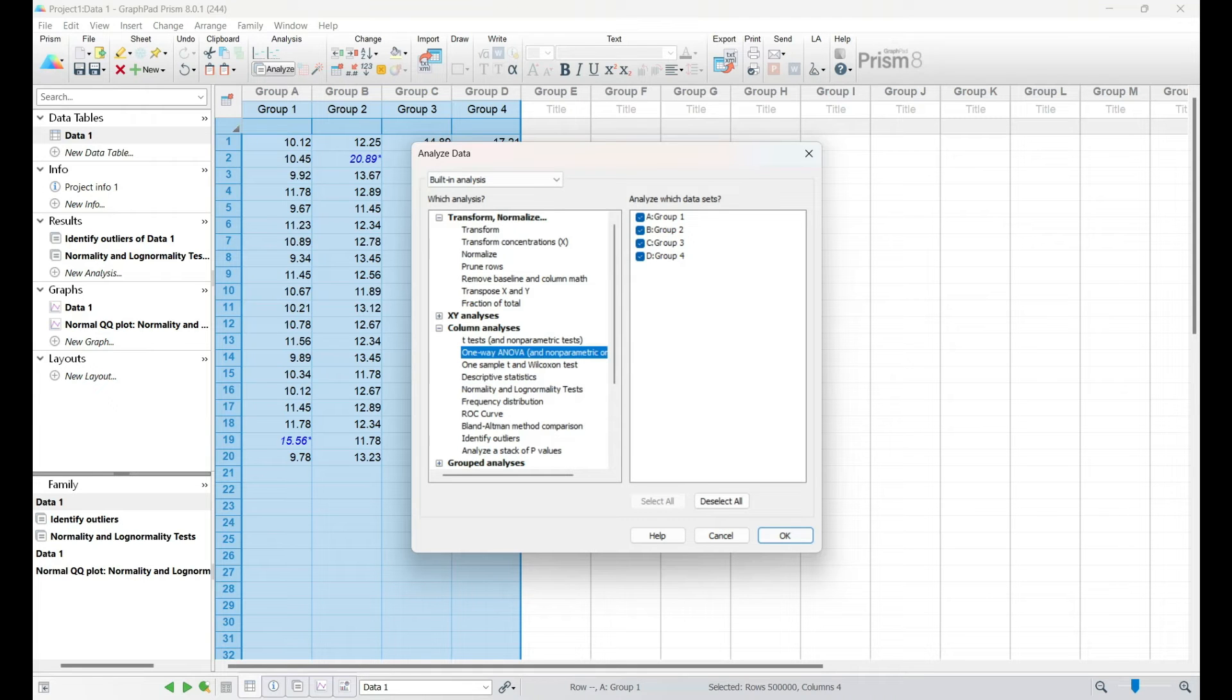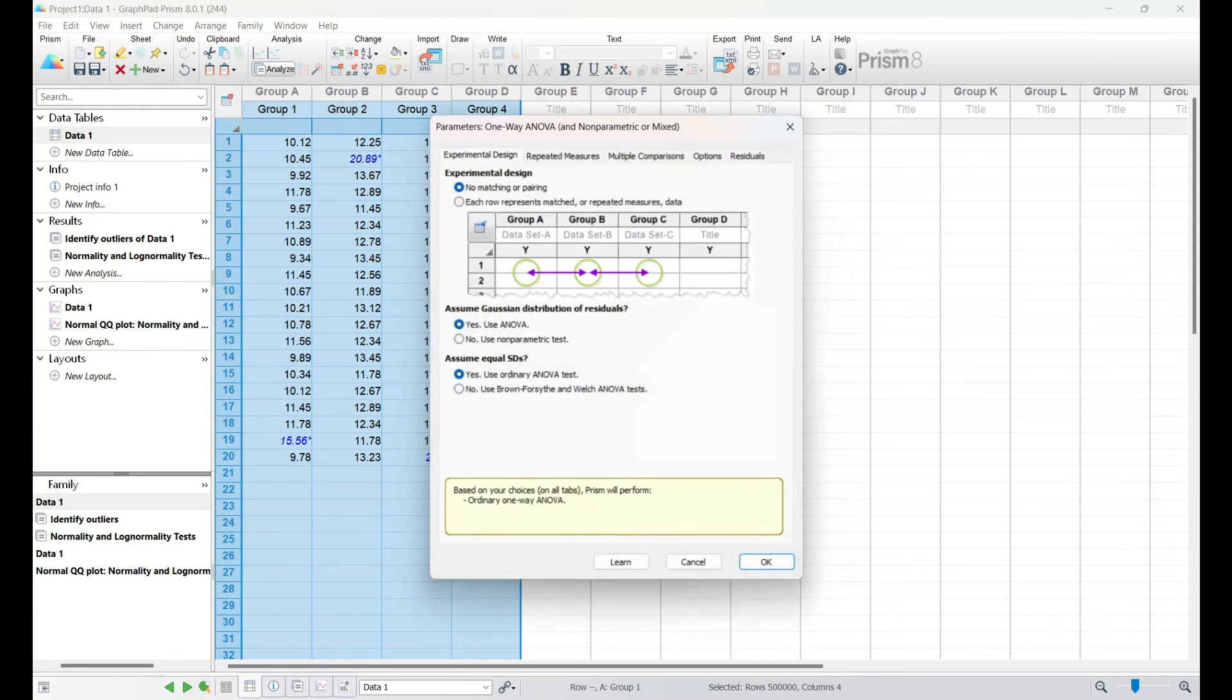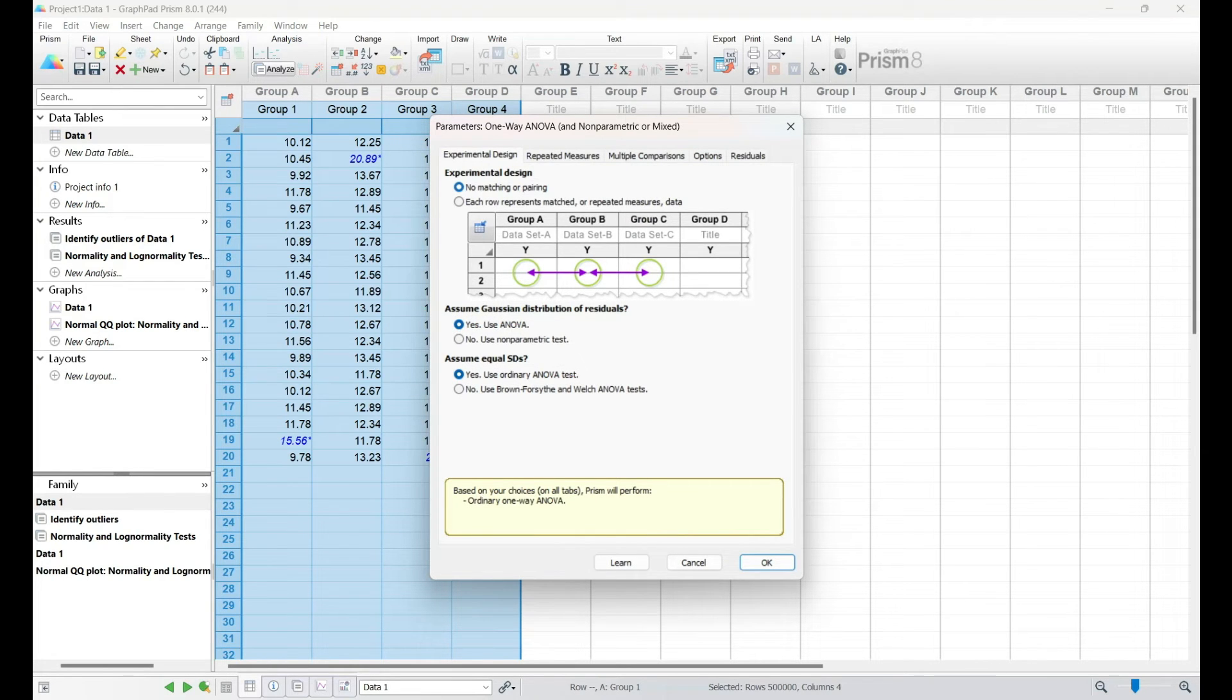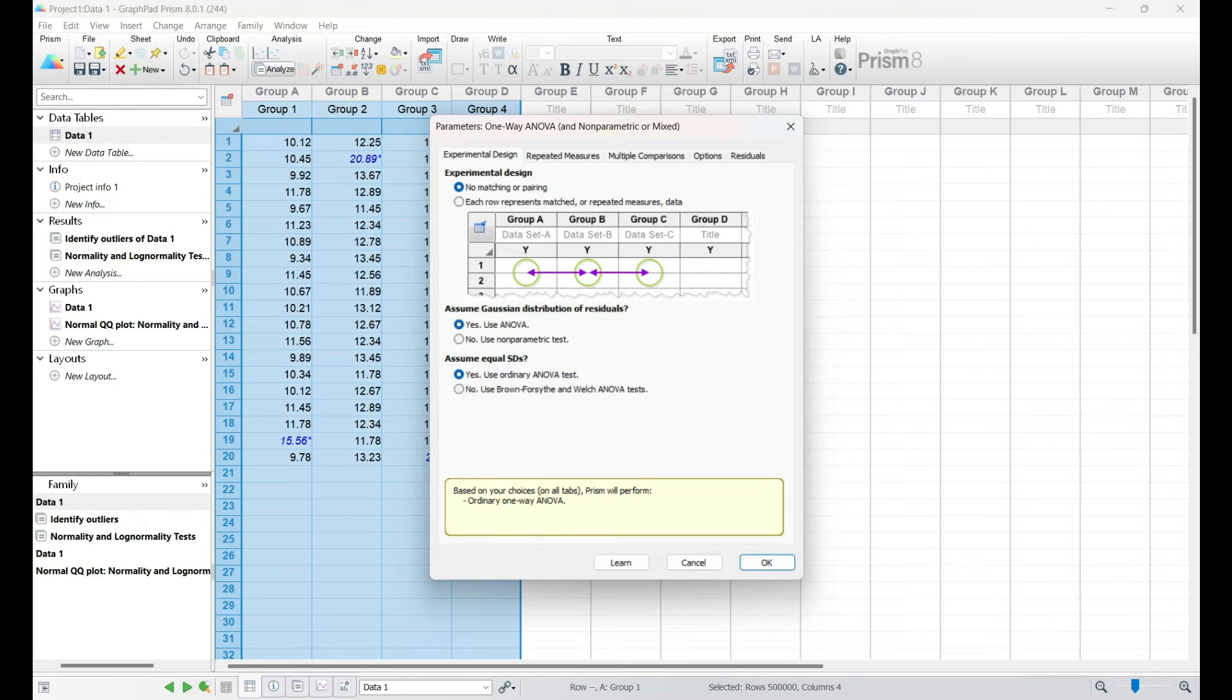I'll guide you through the decision-making process, considering the nature of your data and the research question at hand. Understanding the distinctions between these tests is crucial for accurate interpretation and drawing meaningful conclusions from your analysis.